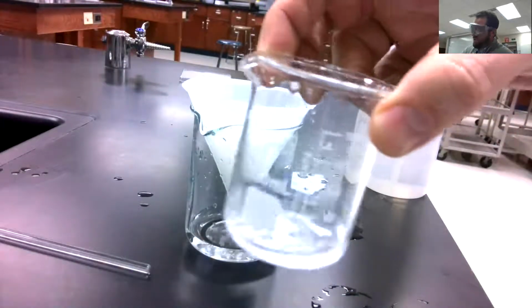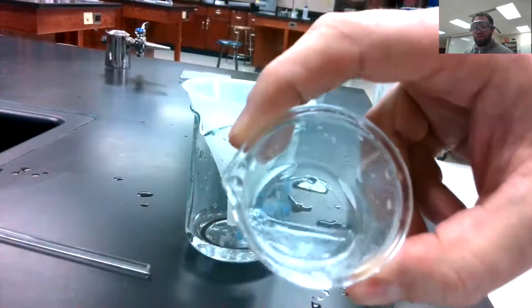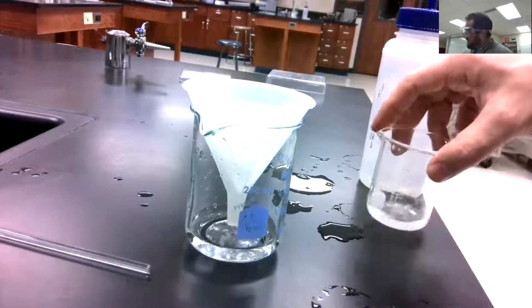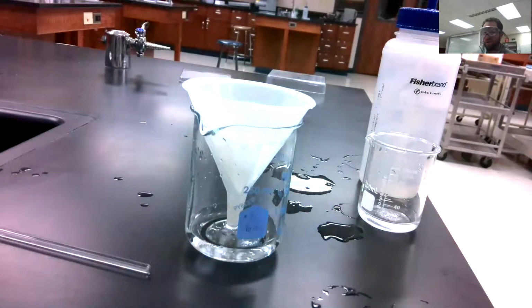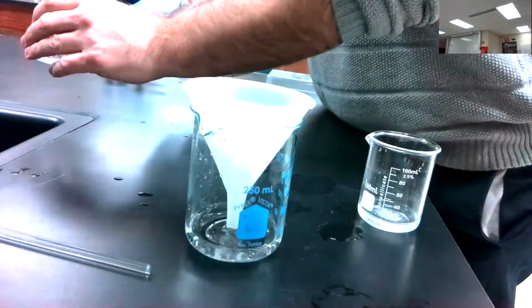And I'm trying to get all that salt. You can still see there's some white in there. Still some salt. I gotta get that all into the filter paper. So I'm going to go ahead and try it another time here as soon as that continues to drain. So it's a nice slow lab we work on here. No rush. And you guys are probably still working on your stoichiometry and make it look pretty. It's a piece of artwork you guys should be turning in. Kind of start to clean up some of these other parts of the lab.